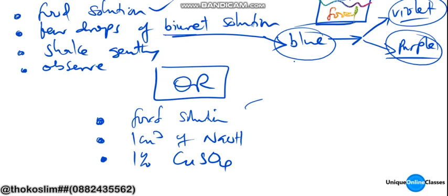Combination of this is the same as the biuret test. So that's the thing.